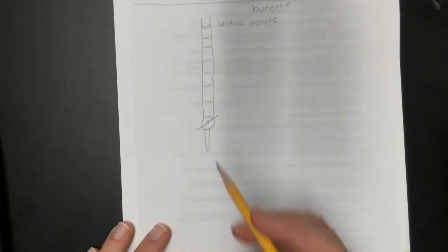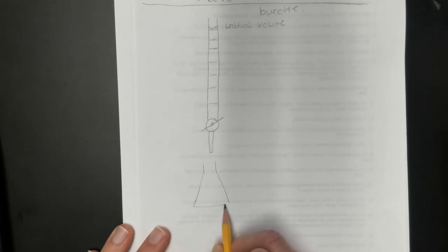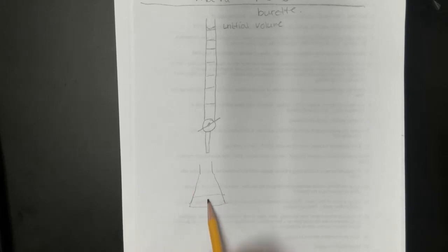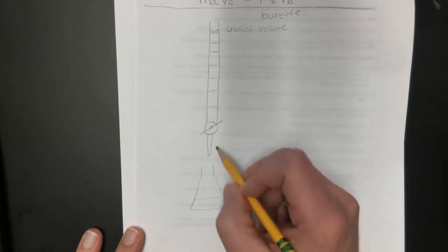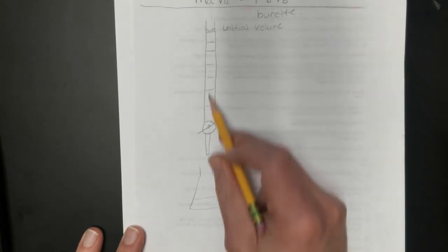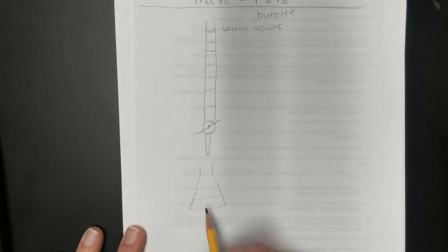After you get the initial volume, you have an Erlenmeyer flask down here that contains your sample. In the first part of the experiment, this flask will contain the potassium hydrogen phthalate, KHP. In the second part of the experiment, it will contain the acetic acid. The point is, you turn this little valve here, and sodium hydroxide in this burette is released into this flask. You also have phenolphthalein indicator down here. You swirl the flask around to make sure proper mixing is occurring as the sodium hydroxide is added. And then you look very closely and wait for a color change.